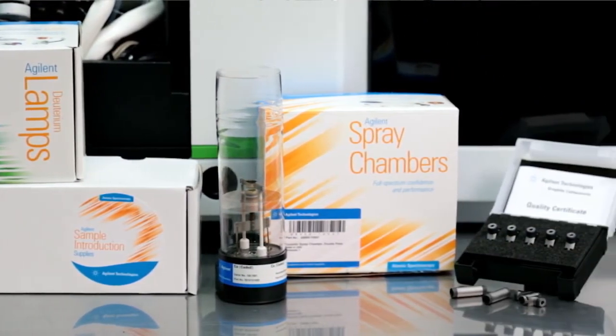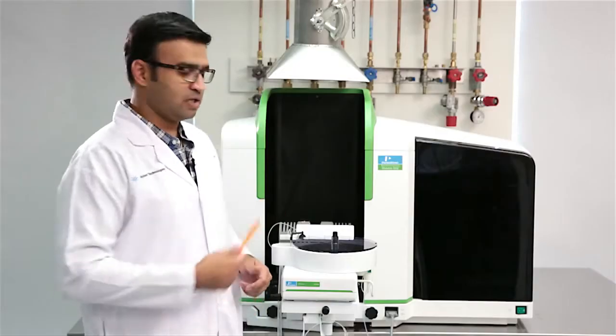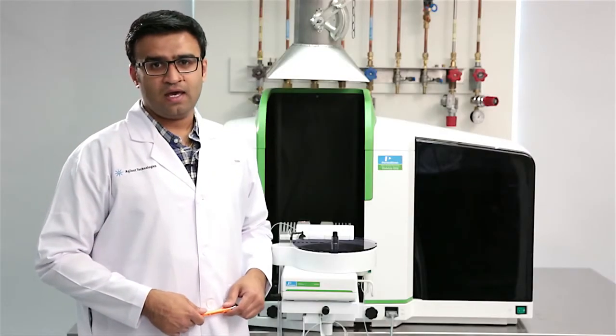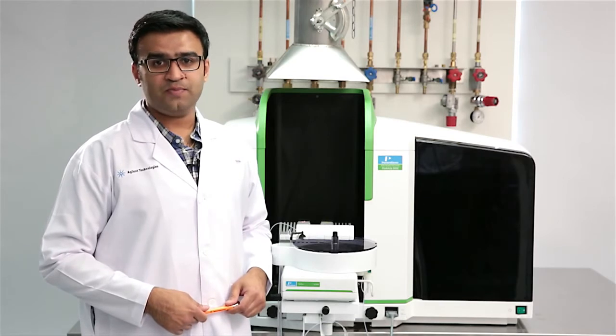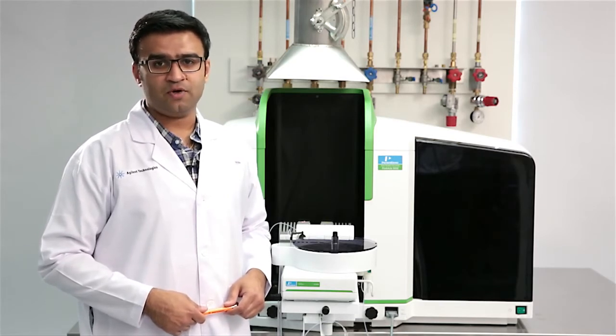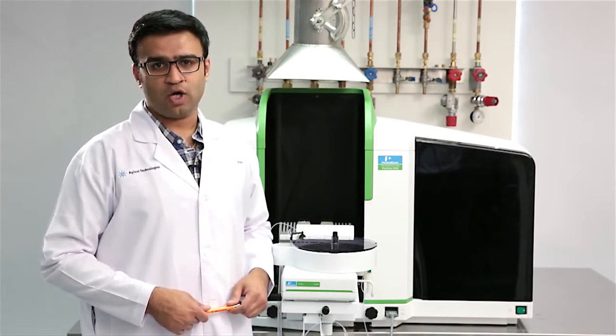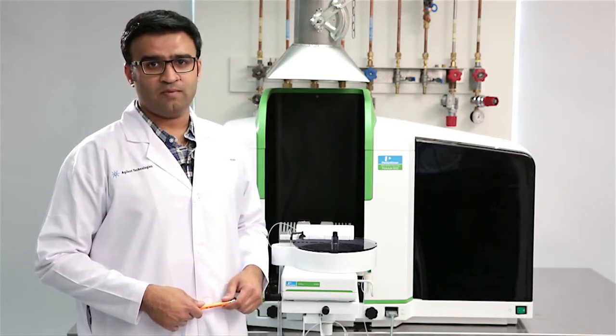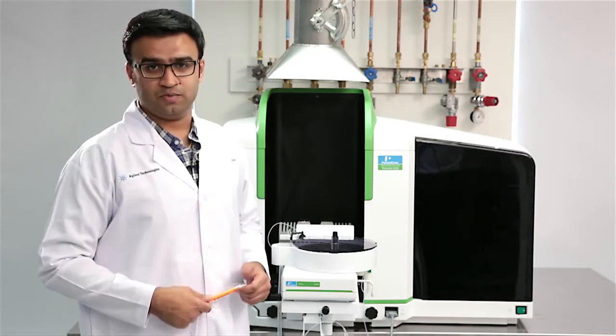ICP-OES and atomic absorption systems like the Pinnacle 900Z. This is an instructional video to help you achieve the best performance and productivity for your Perkin Elmer atomic absorption systems, and I'm going to start off by showing you how to replace the graphite tubes.